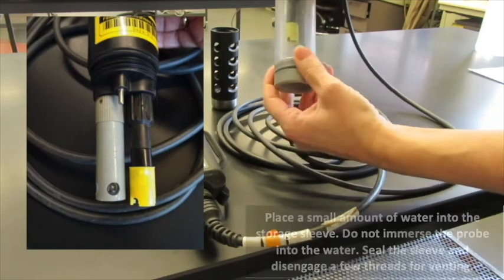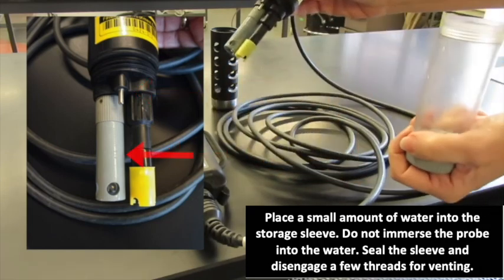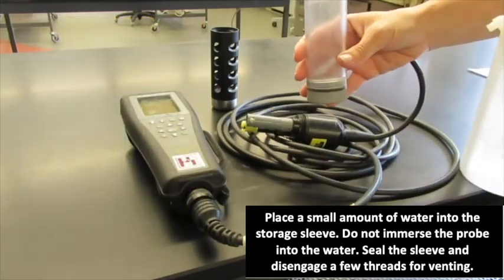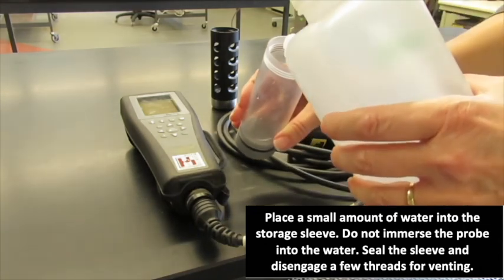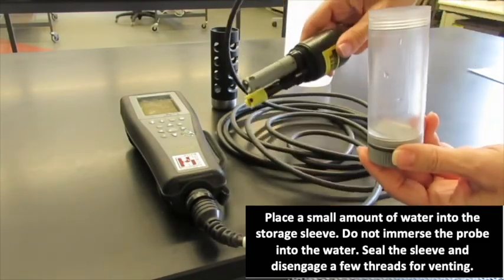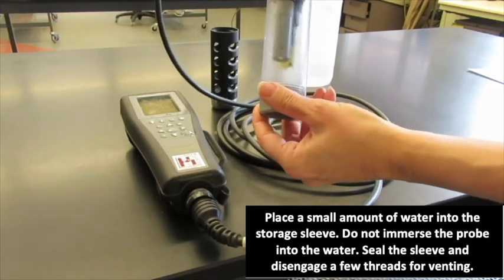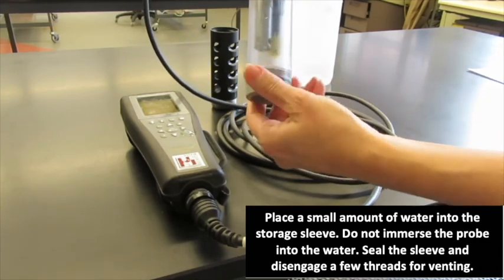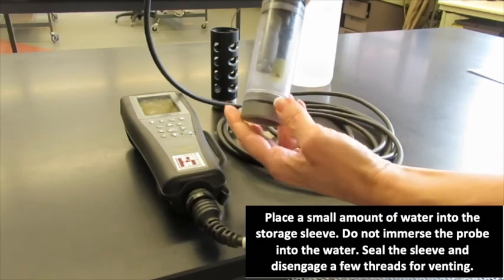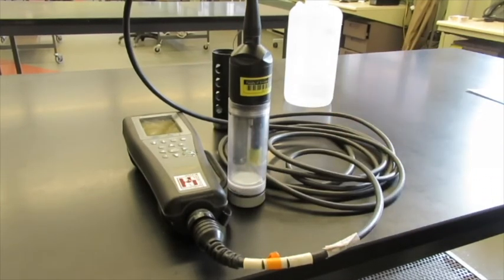What we have here is a plastic storage sleeve with the probes — this is our dissolved oxygen probe, we have temperature and pH. What we will do is add a little bit of moisture into the storage sleeve. We want to make sure that our probes are not immersed in this water, and we shake off a little bit of the water droplets. We screw on this plastic sleeve tightly and then disengage a couple of threads.